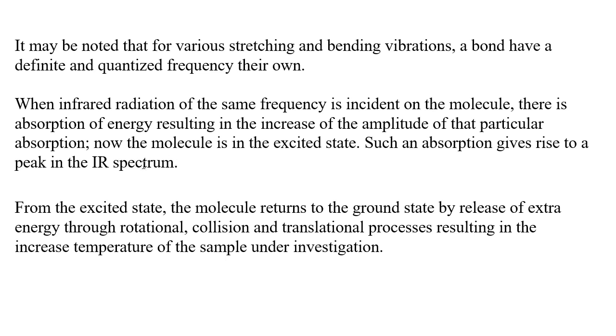Then what happens when the molecule gets excited? From the excited state, the molecule returns to the ground state by release of this extra energy either through rotational, collision or translational processes, resulting in the increase of temperature. By this process, there will be an increase in the temperature of the sample under investigation. That is what is happening after the absorption of IR radiation.